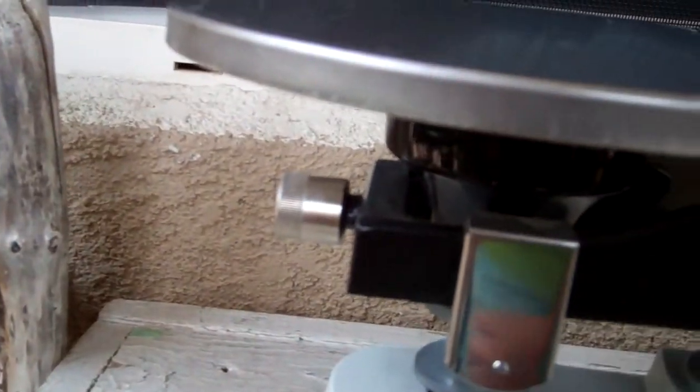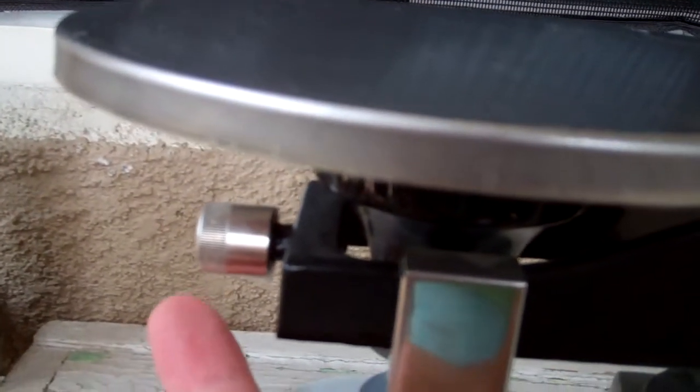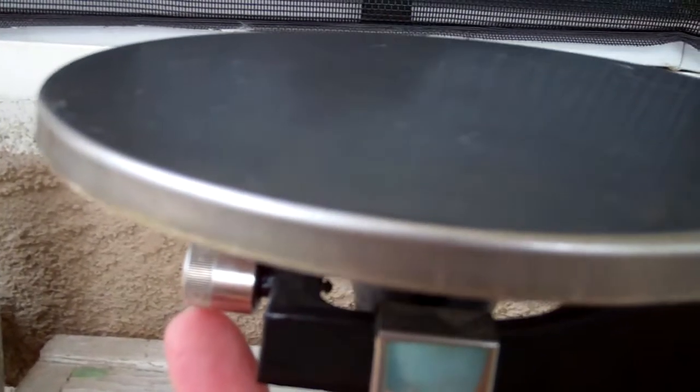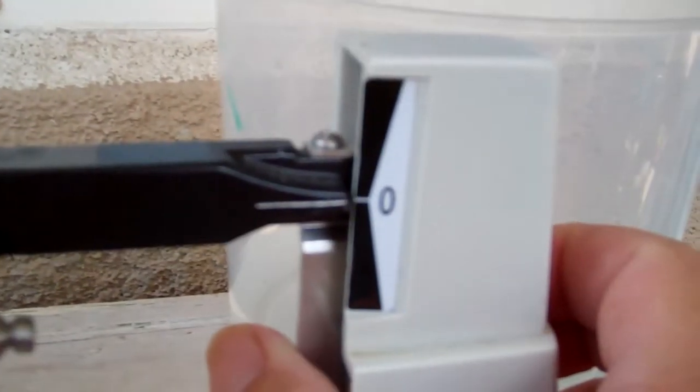You can adjust it with the adjustment knob right here underneath the pan. To make the line, you want it to come down. Then you're going to turn the knob towards you.